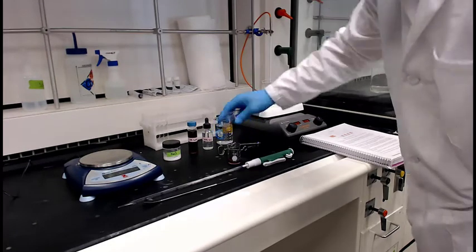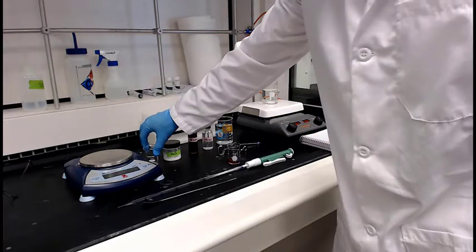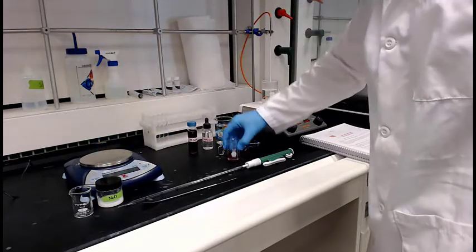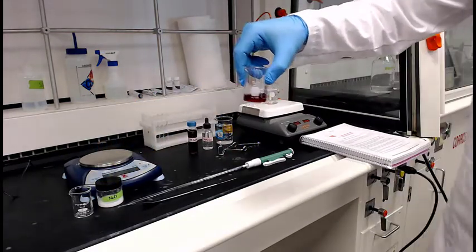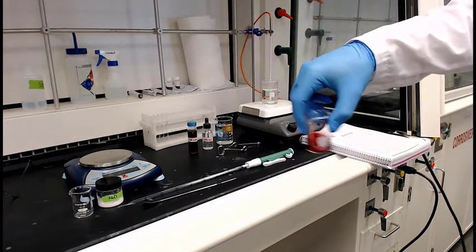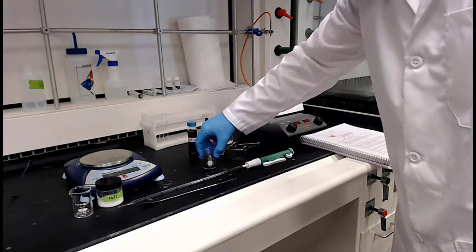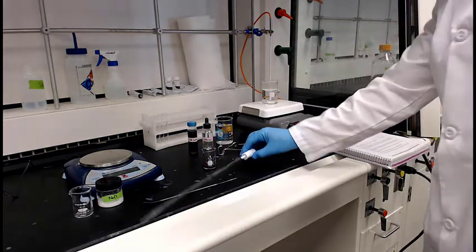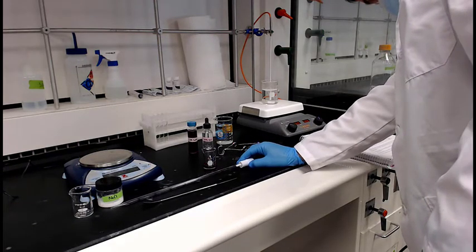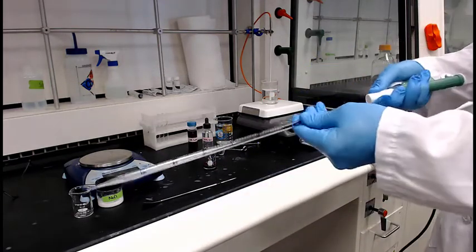Now this would be a good time if you have what's called a glass stir rod. Even that metal spatula, that's okay, you could use it. You can just swirl like the technician's doing there. Put a magnetic stir bar in there and put it on a separate stir plate. There's a lot of ways you can mix that up. Okay, but now this is the standard equilibrium solution, so everything we're going to do is basically going to hinge off of that particular reaction.